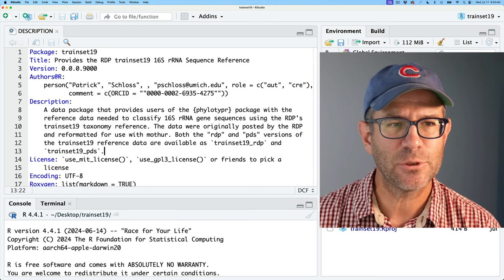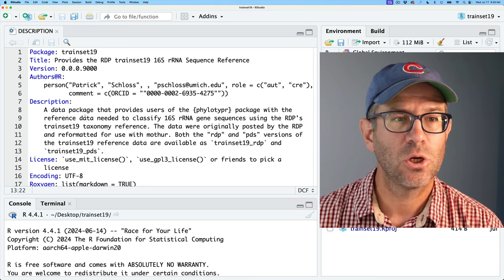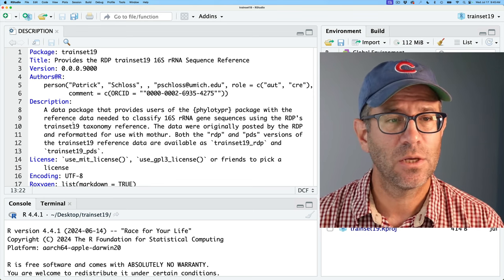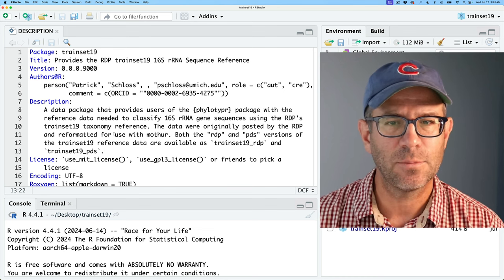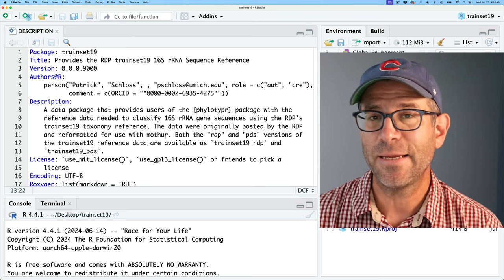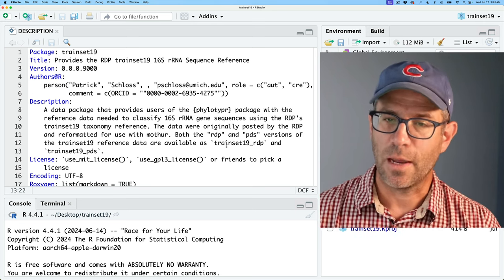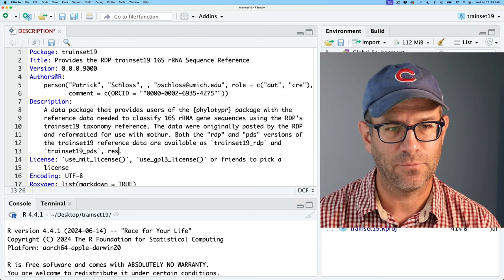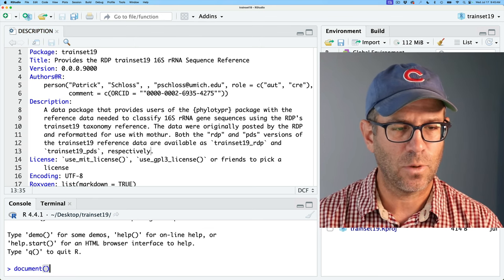I went ahead and wrote a description: 'A data package that provides the users of the phylotypr package with the reference data needed to classify 16S rRNA gene sequences using RDP's trainset 19 taxonomy reference. The data were originally posted by the RDP and reformatted for use with mothur. Both the RDP and PDS versions of the trainset 19 reference data are available as trainset19_RDP and trainset19_PDS respectively.' Let's go ahead and make sure that works by running document().